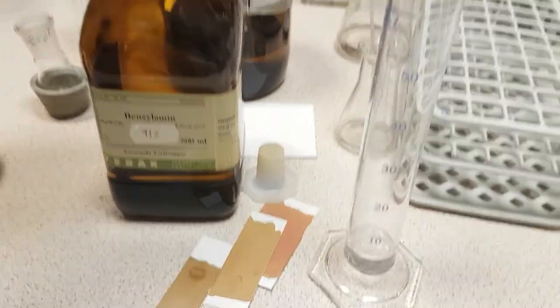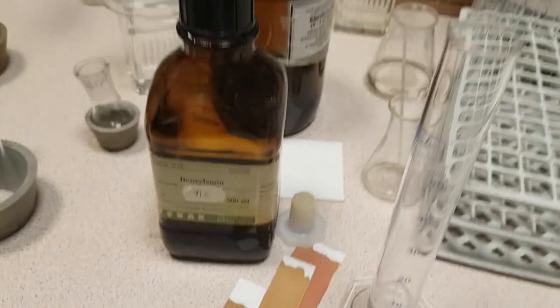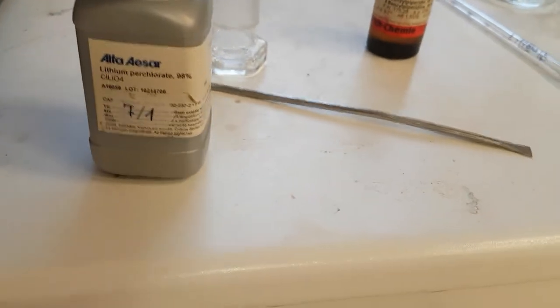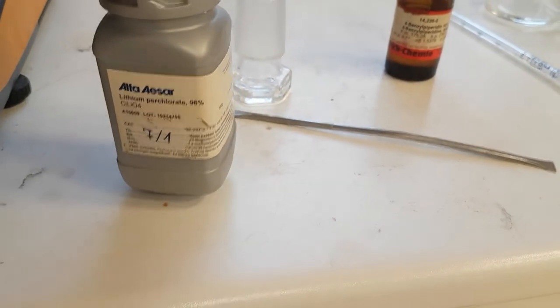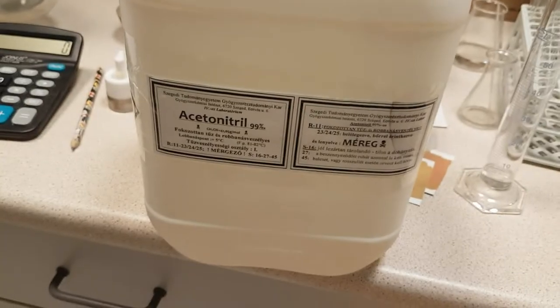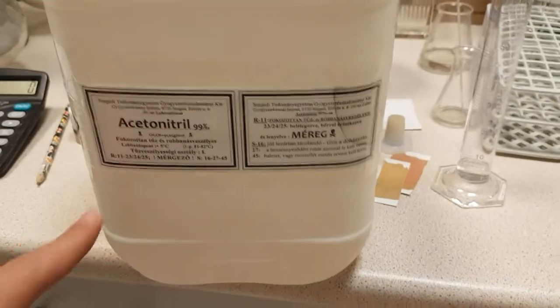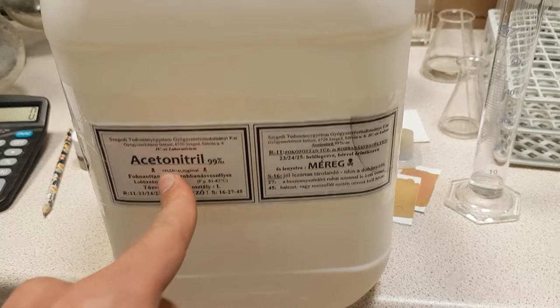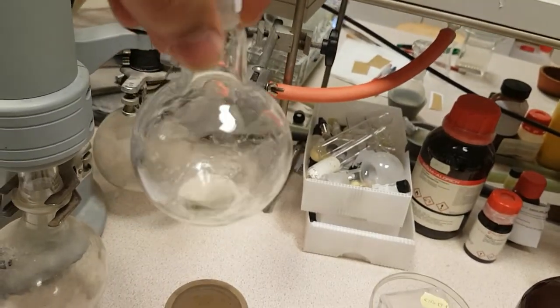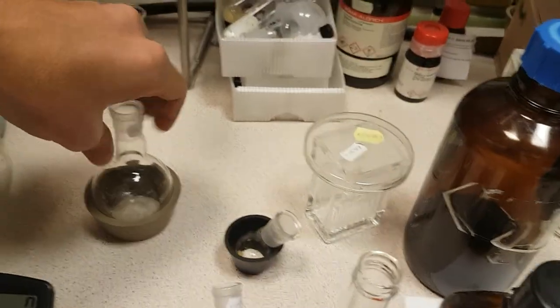We will need a catalyst to facilitate this task — this is lithium perchlorate. It is a catalyst used to make the process of opening easy. As a solvent, we use acetonitrile — this is the solvent where we perform our reaction. This is the substrate, the molecule that we prepared before. Usually we use two equivalents of the reagent, the benzylamine, and only one equivalent of the catalyst, which is the lithium perchlorate.